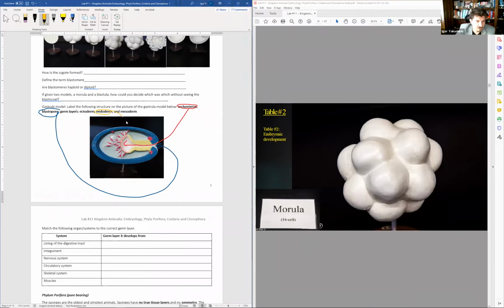So, and here it is. You can do that, yes. It's not very pretty per se, but as long as I can understand, and it's not like a web, which is kind of hard to trace. But most of you are doing a really nice job just going with the straight lines and markings there.